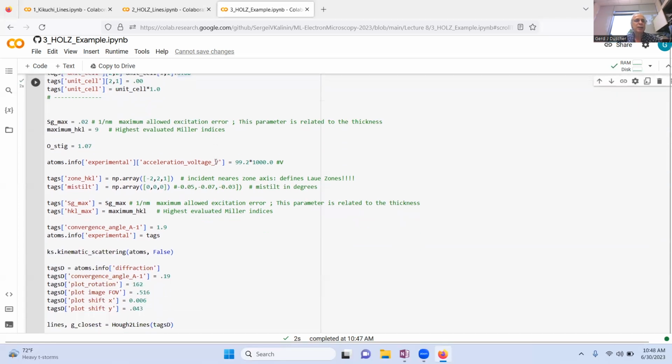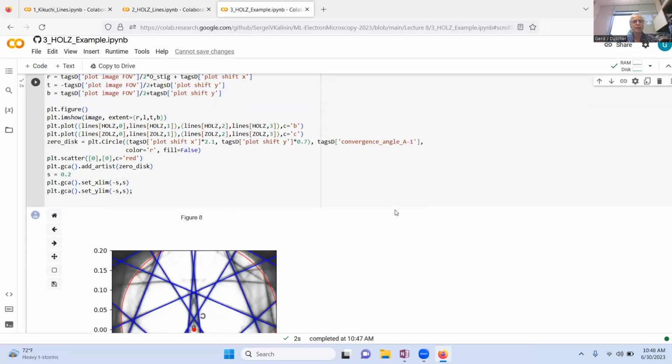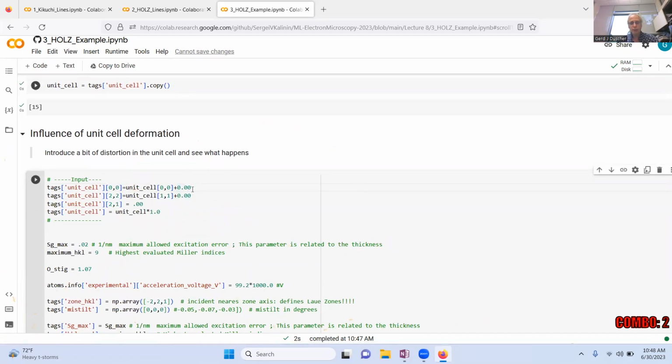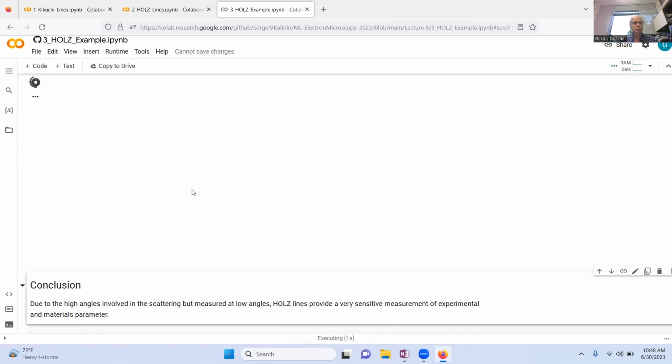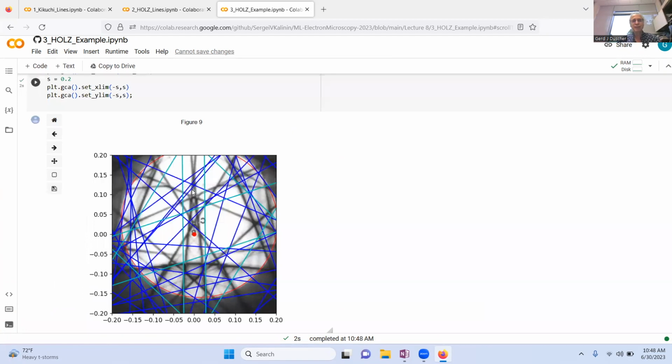So here's our perfect match, right, with the small changes. So let's go and add 5 picometer. Okay, it's angstrom, so 5 picometer. Complete disaster. So 5 picometer is way too much for that.